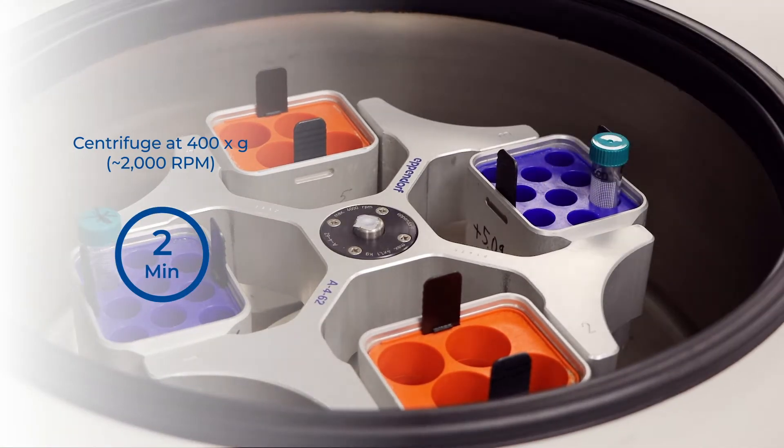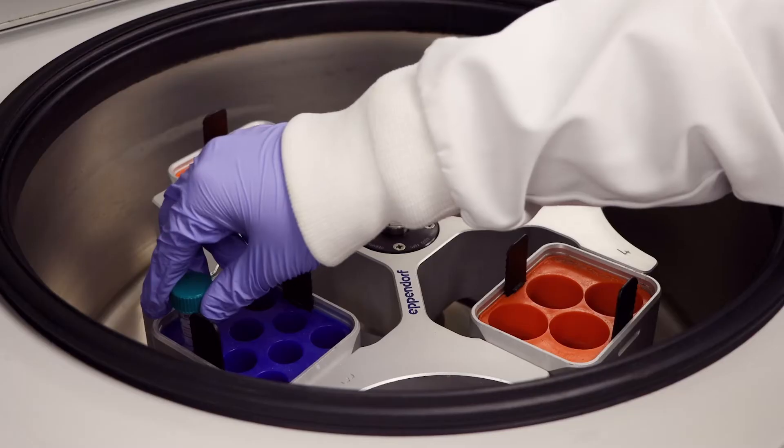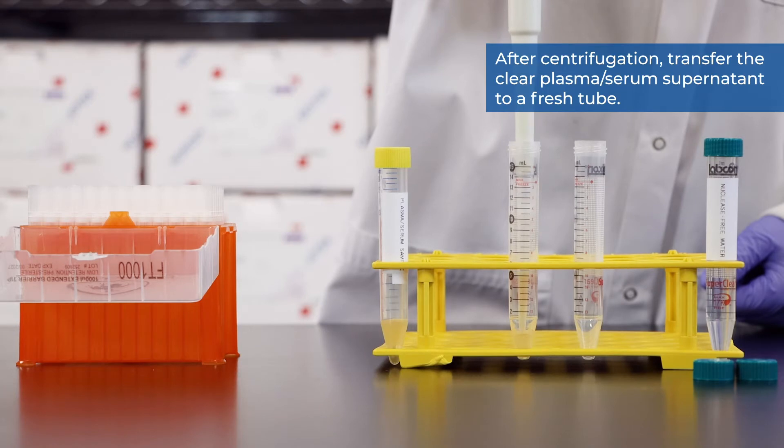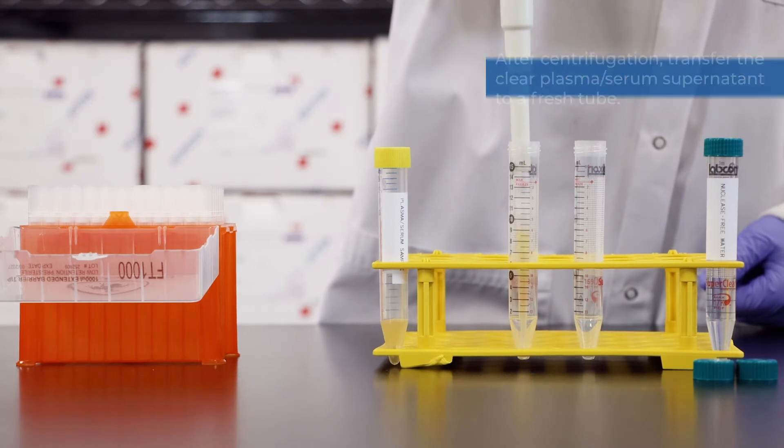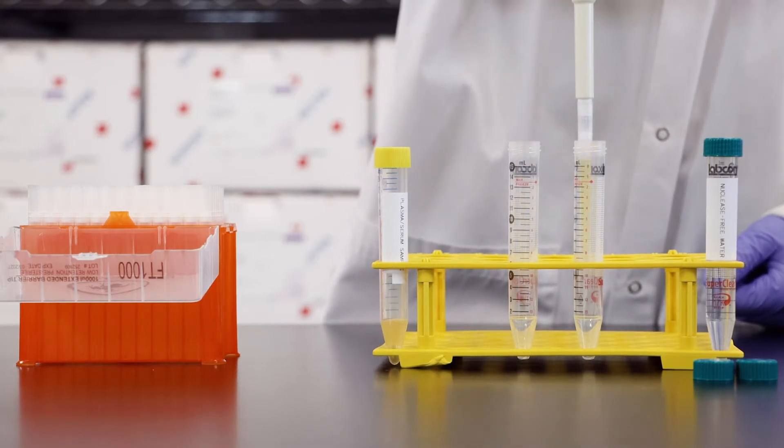Centrifuge for 2 minutes at 400g or 2000 RPM. After centrifugation, transfer the clear plasma serum supernatant to a fresh tube. Your cell-free plasma is now ready for exosome purification.